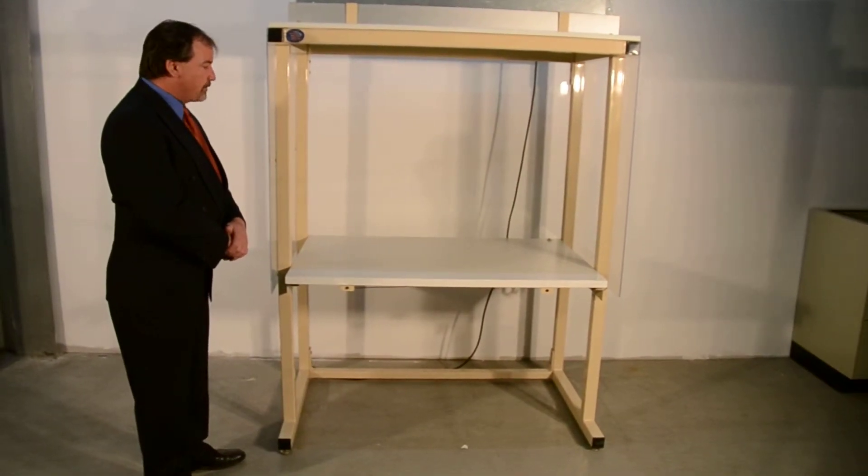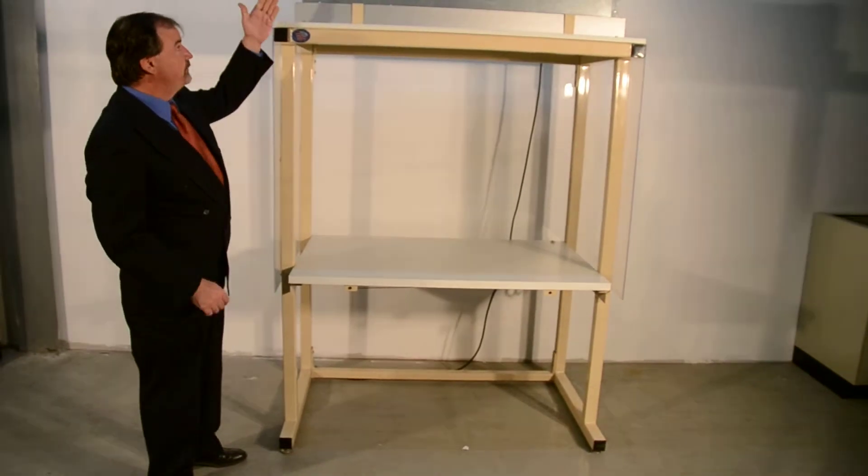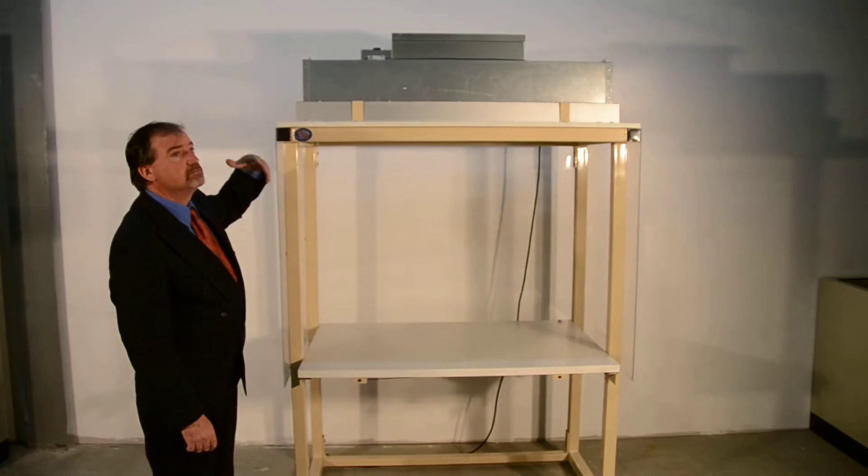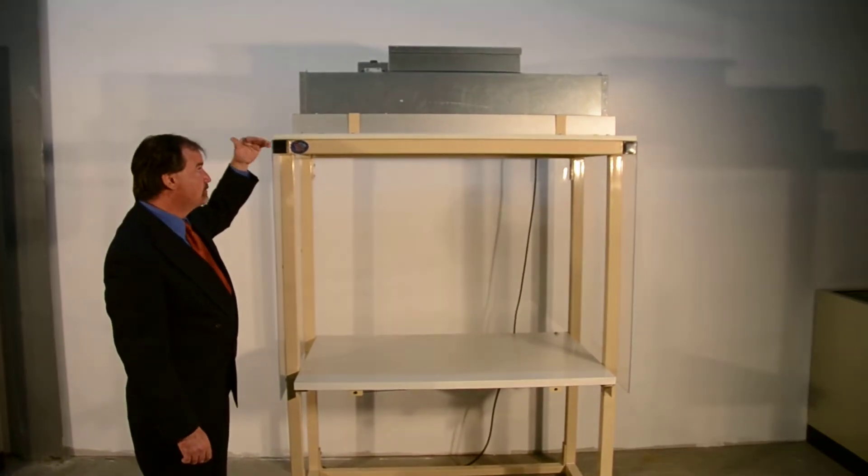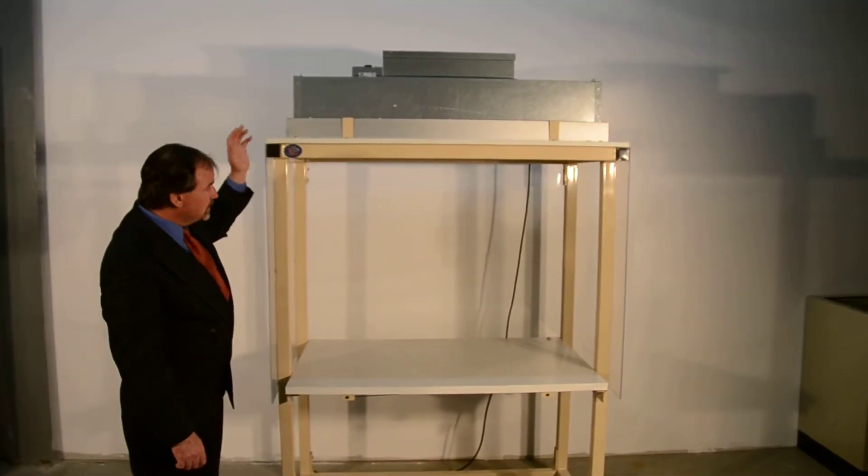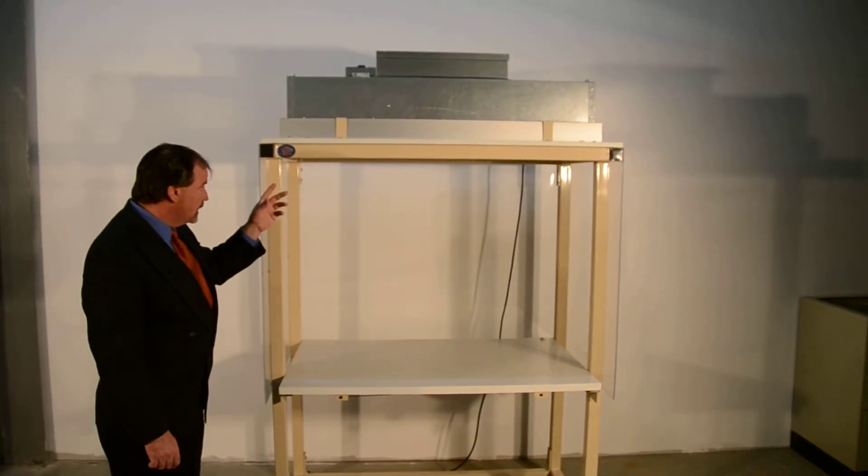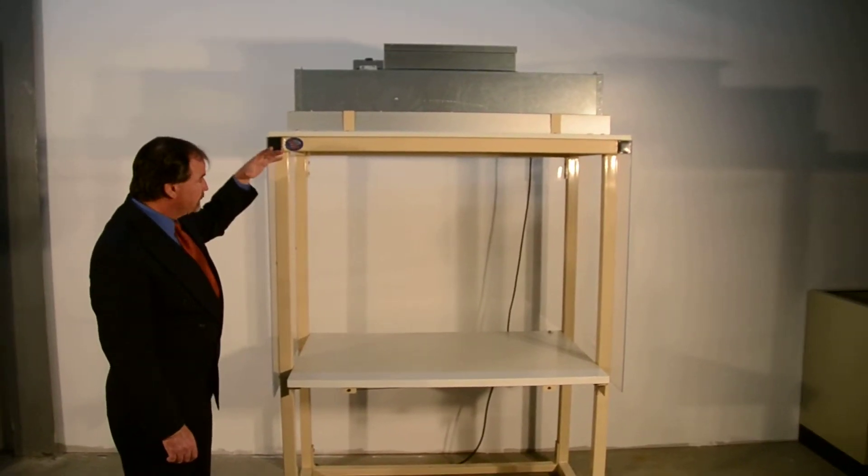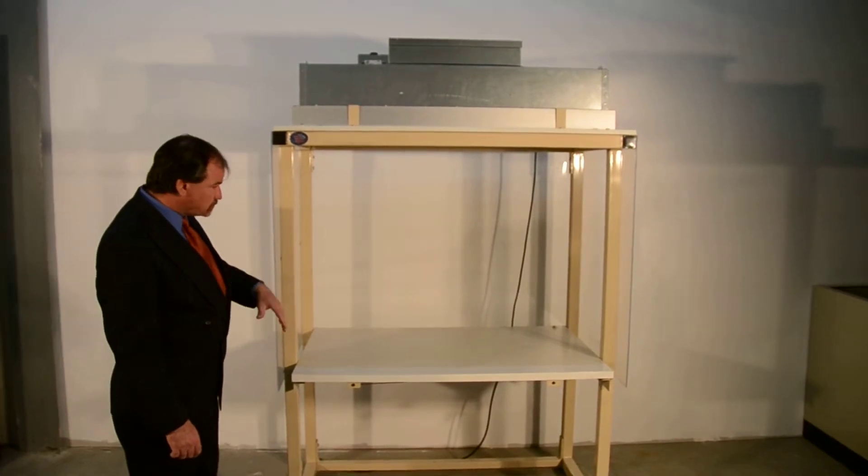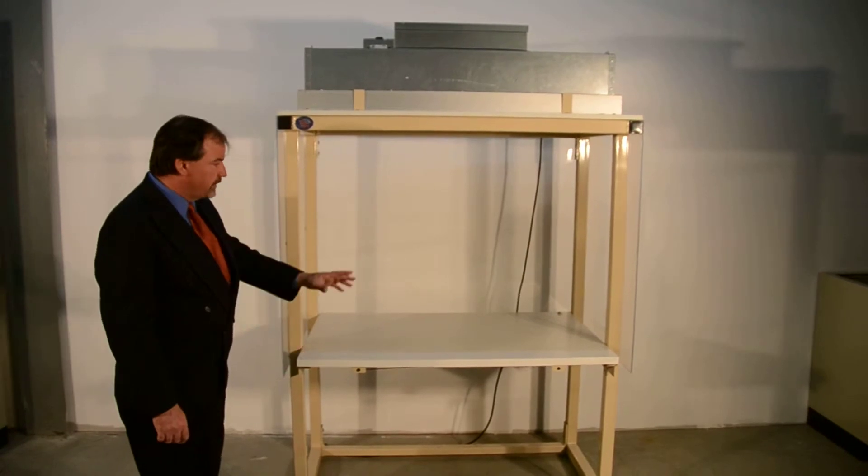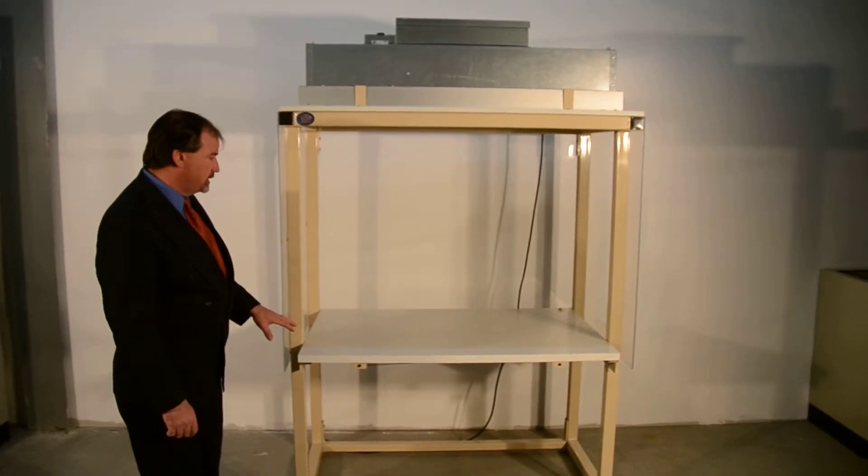The way this unit operates is we have a pre-filter, then we have a fan that draws particles from the air into the HEPA filter, and then it's 99.9% clean by the time it comes out of the HEPA filter. A flow of air runs down, and it pushes out of the work surface area that's enclosed in three sides with plexiglass.